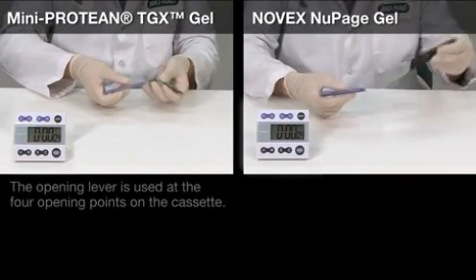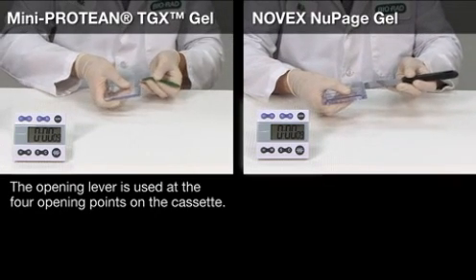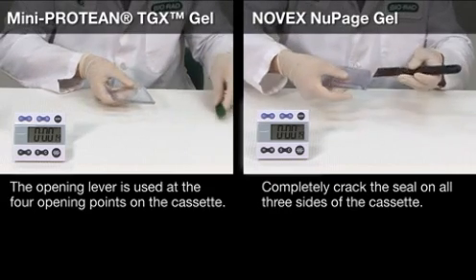To open the TGX gel, you simply crack it open at the four points indicated by the arrows on the cassette. The Novex NewPage gel cassette requires that you crack the seal on all three sides.